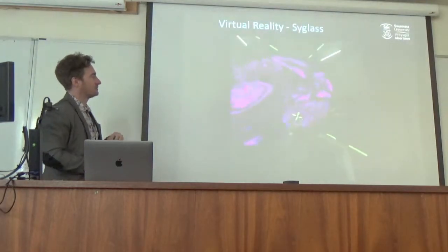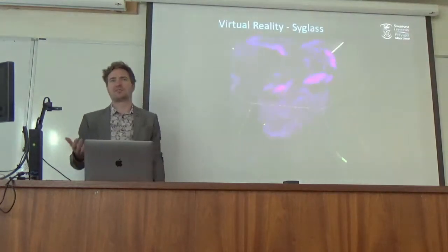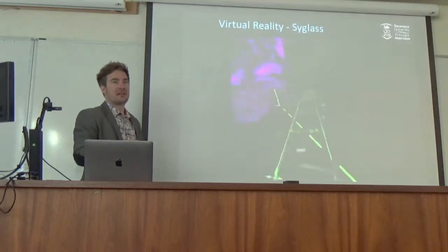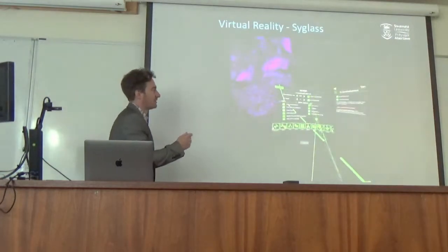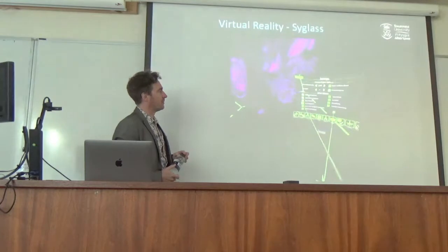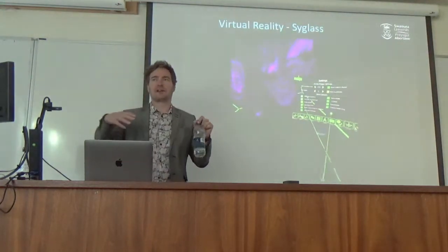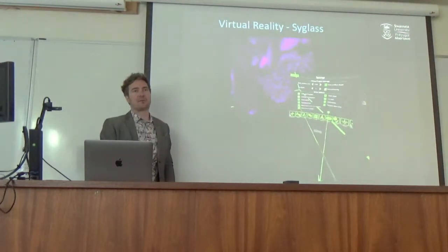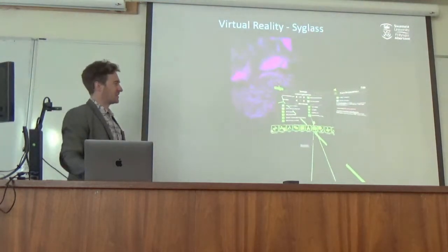And when we talk about tagging things or creating your learning data set for VR, it's always on these 2D slices. But if you can do that within the 3D, then you're tagging multiple slices in one go, with some kind of reference within that. And I think that's potentially where we could move forward, where within VR you get this holistic view of the whole organism, the whole sample, the whole material, and you can tag across what is effectively multiple slices, and then use those parts as your learning data set for multiple samples, potentially.